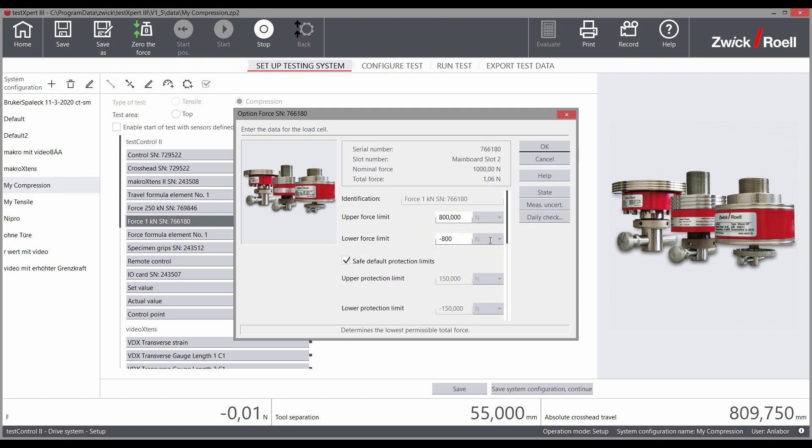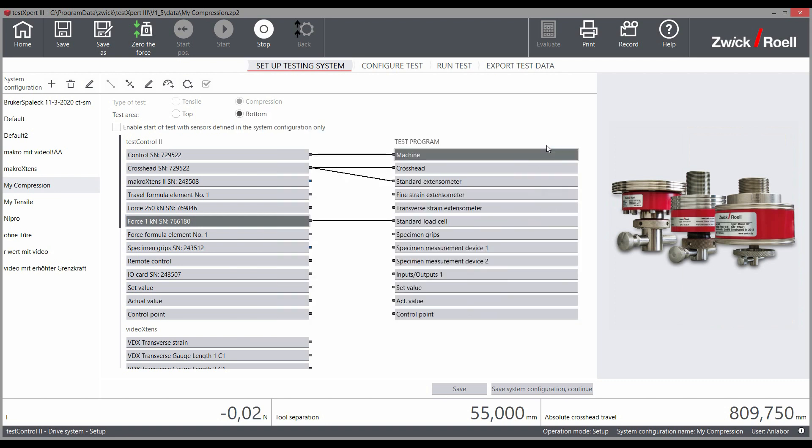Afterward, save all the settings that you configured and the key switch then protects them from any unauthorized changes.